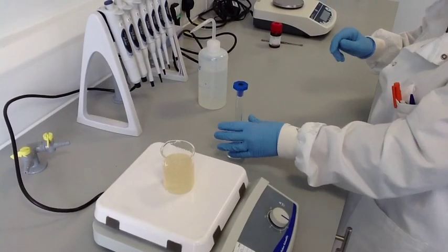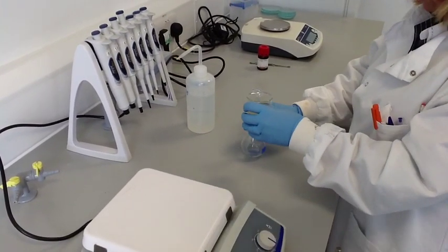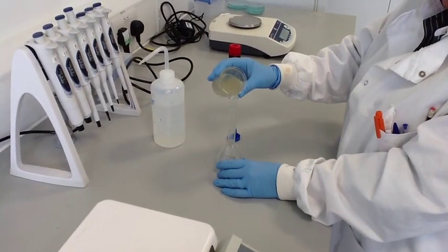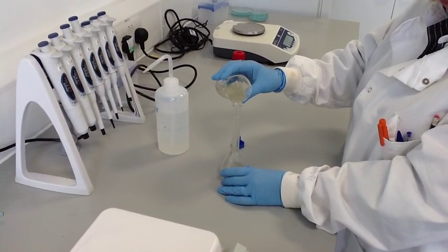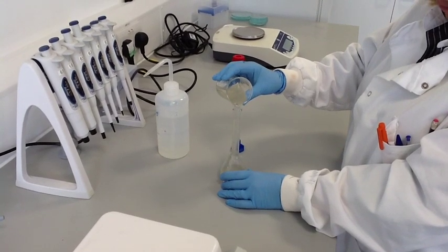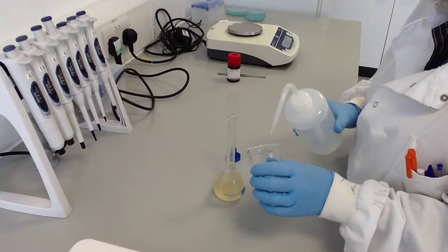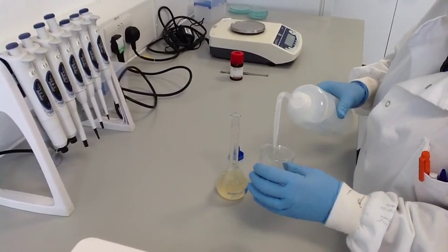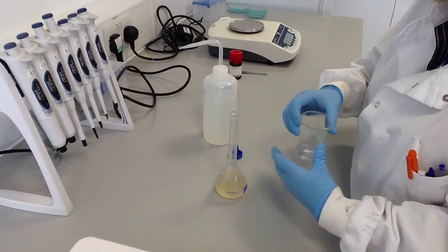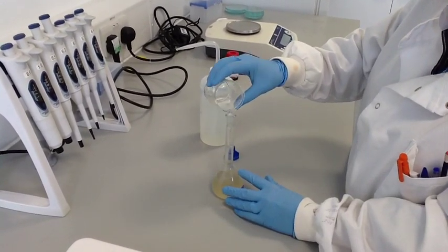You sometimes need to turn the stirrer off briefly and break up any stubborn lumps with a spatula. Once all the alginate has dissolved, you can add more distilled water to make up to 100ml in a volumetric flask. Your sodium alginate solution is then ready to be used in the investigation.